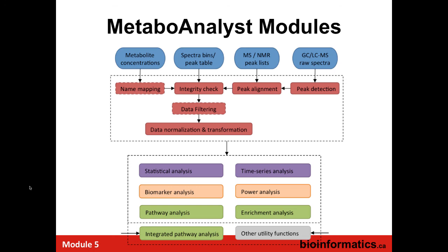It will do a variety of things. It'll do name mapping, name normalization. We'll see some examples of that. It'll look for the data integrity. It'll also, if necessary, deal with peak alignment or peak detection. No matter whether it's LC, GC, NMR, raw lists, peak lists, or whatever, it will go through some sort of data filtering step. And then you, as a user, have to do data normalization and transformation and scaling.